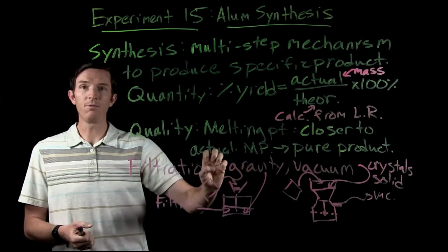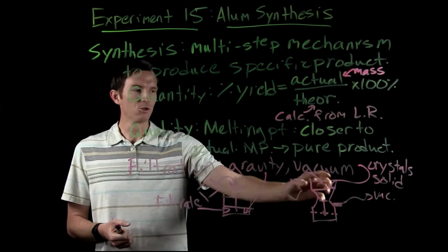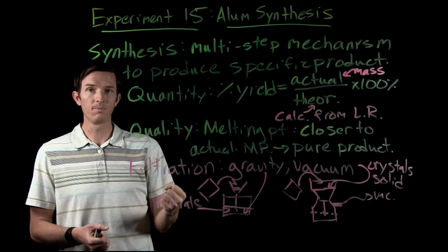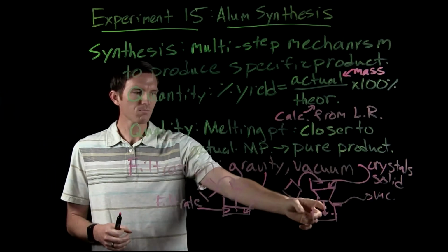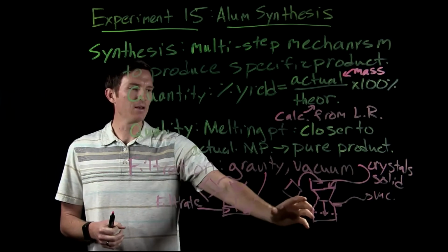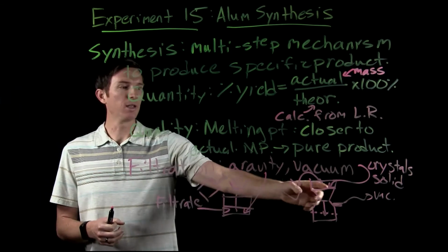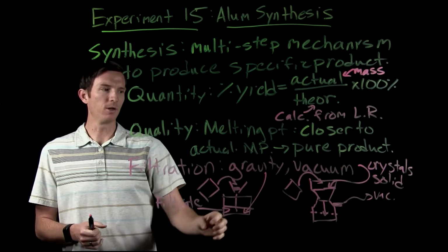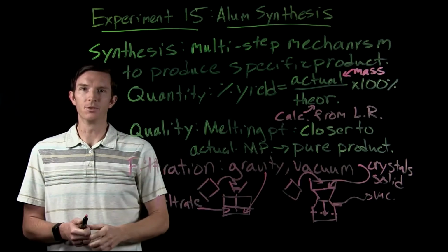Vacuum filtration is really helpful when we're trying to focus on drying out maybe a crystal or separating a crystal or a solid from a liquid. And we usually have a small amount of liquid that we're going to pull through. And that way we can really get a good solid left over. The crystals are able to dry very well. And that's when we use vacuum filtration.